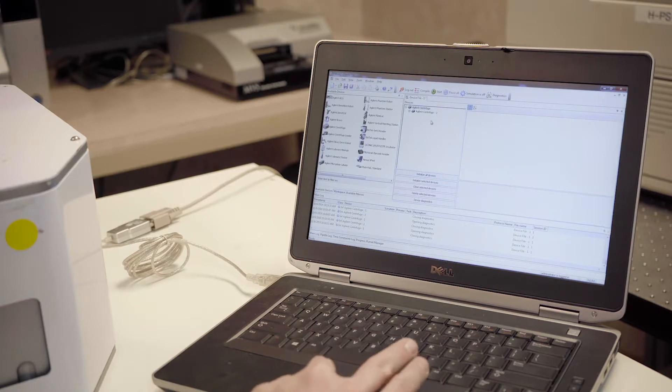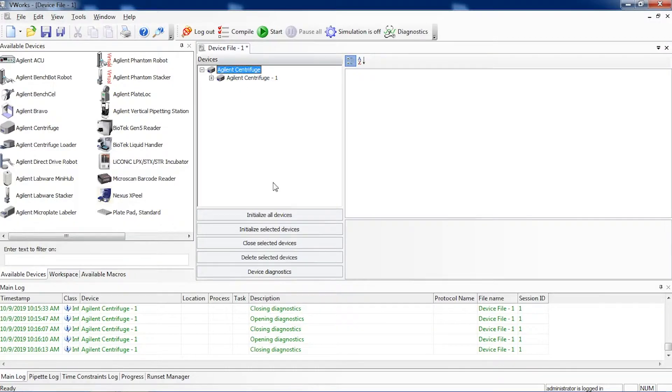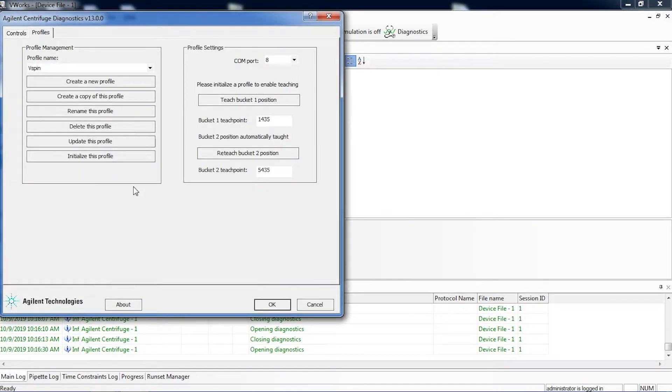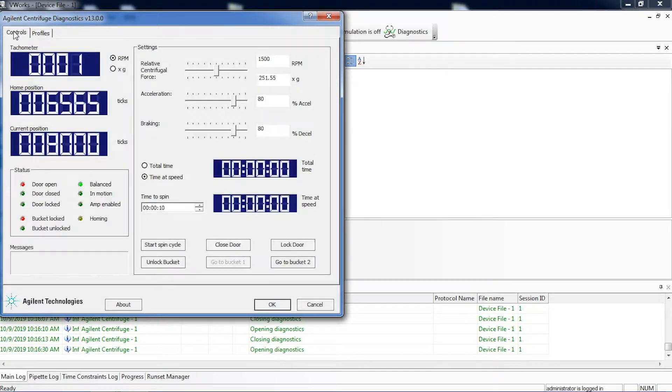From within V-Works, select your Agilent centrifuge, go to device diagnostics, first initialize the profile, then go to controls.